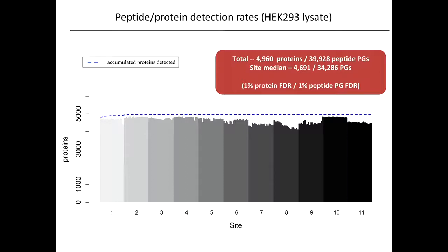We actually learned in this context, which delayed this publication for almost a year, that when initially the analysis was compiled through these 200 plus runs, this curve started going up. And so we then investigated this, and I think accolades should go to the team that investigated this and was willing to hold this paper back till this was resolved. And we concluded eventually that the sliding that we initially observed, of increasing numbers by more data added, was an accumulation of false positives.